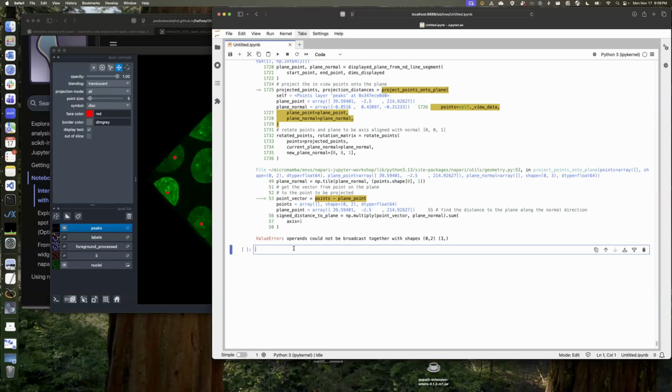Do we want to try the smooth distance transform? I think this is good enough. Let's just skip that. We could do the same thing, right? The same thing that I just did.